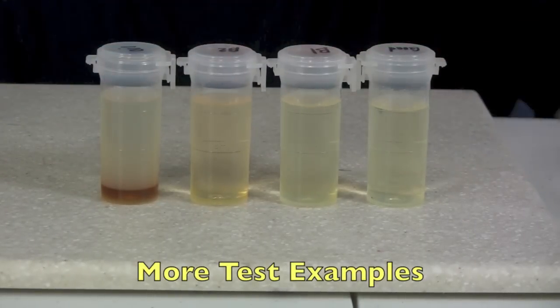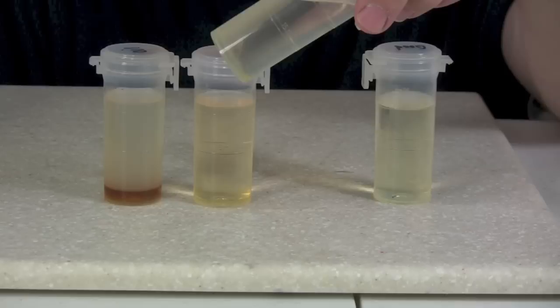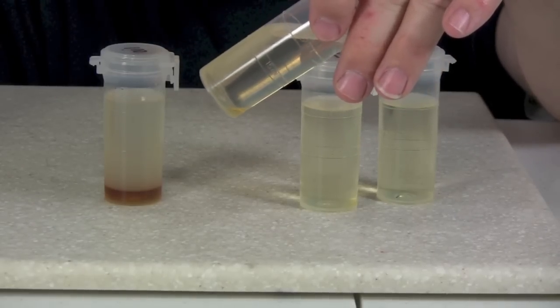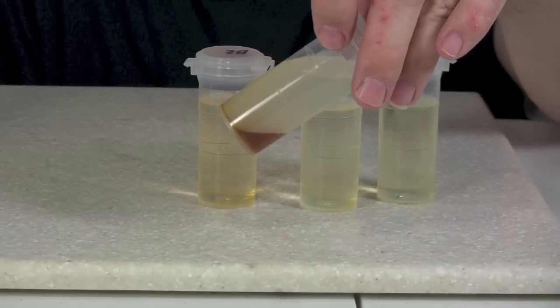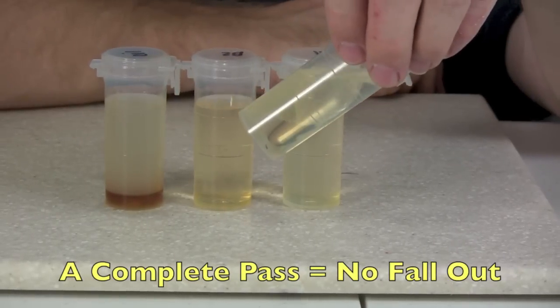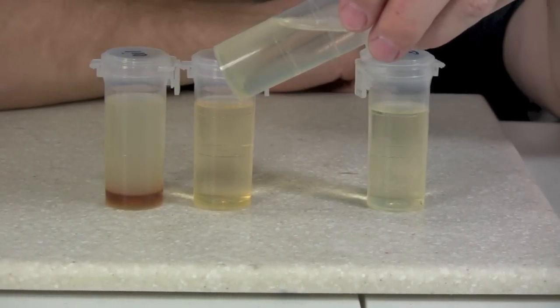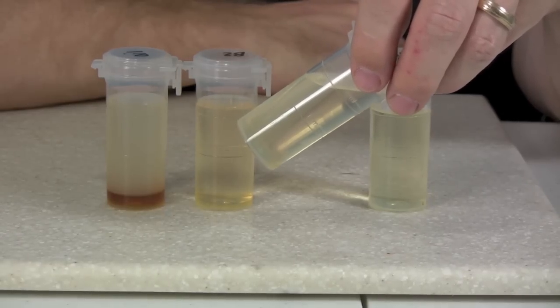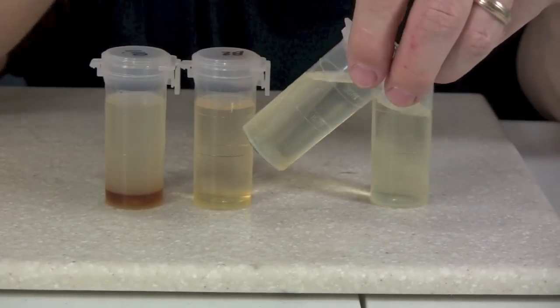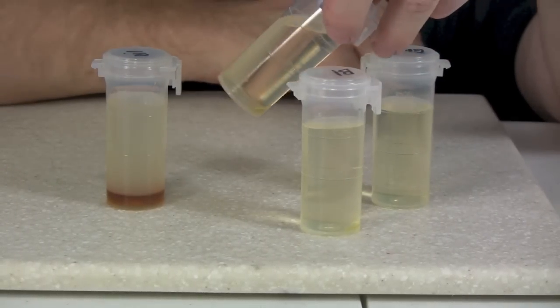This is a really good example of fuel that is completely passing this test — there's absolutely no fallout. This batch almost passed, but there's just a sliver on the bottom. This one has a little bit more puddling — maybe a quarter of an inch. And then you have just standard oil that hasn't been reacted at all. To pass this test, you want your fuel to look completely clear with absolutely no fallout on the bottom. While there's just a tiny little sliver of fuel, it still doesn't pass.